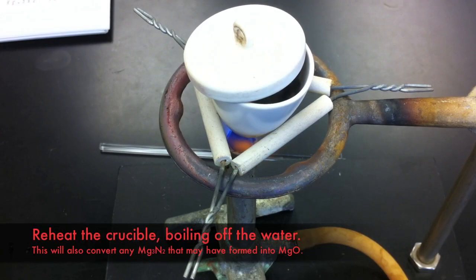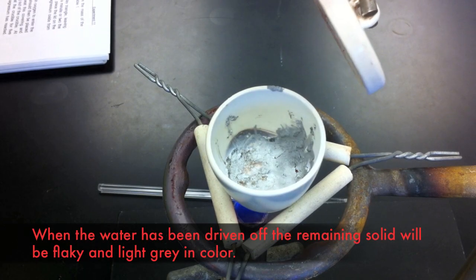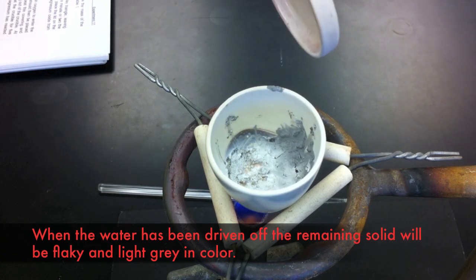Return the crucible to the Bunsen burner and heat it once again. This will complete the formation of the magnesium oxide. This process will take several minutes, but you can check on it periodically, and once it is all light gray color, the reaction is complete.